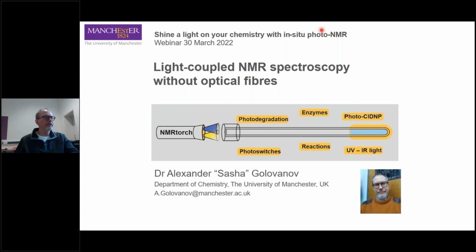Okay, thank you, Philip, for the kind introduction. So, first of all, thanks organizers for giving us an opportunity to speak about our exciting recent developments. Today I will talk about how convenient and easy it may be actually to use light-coupled NMR spectroscopy in the lab.